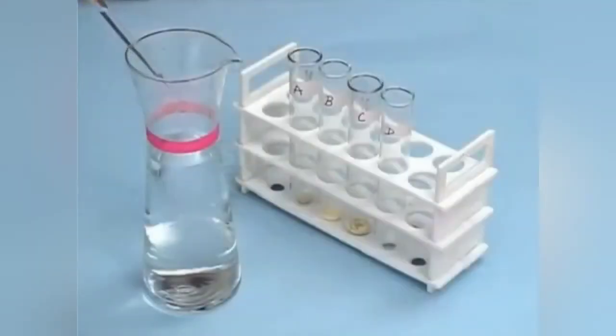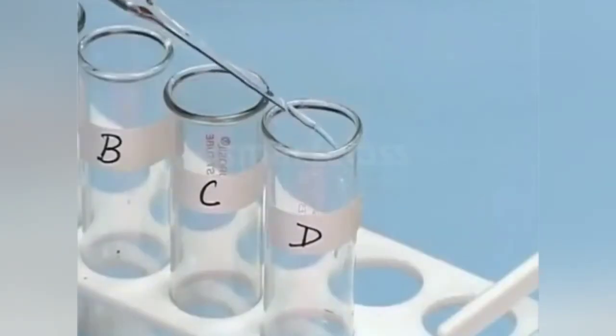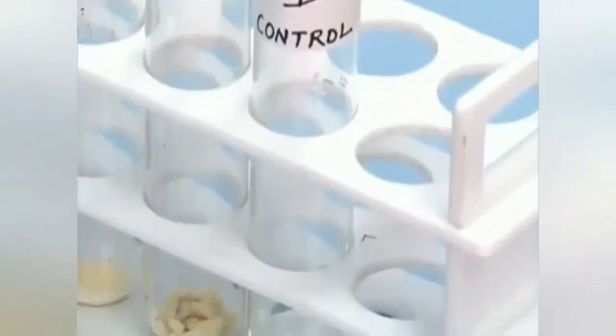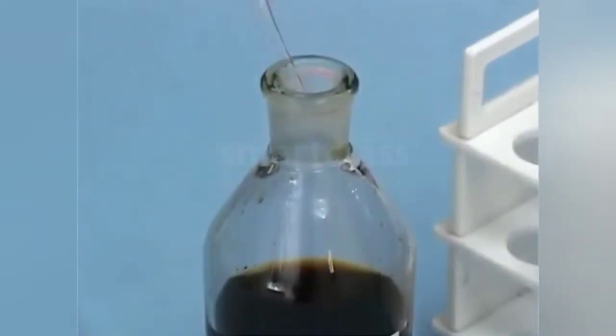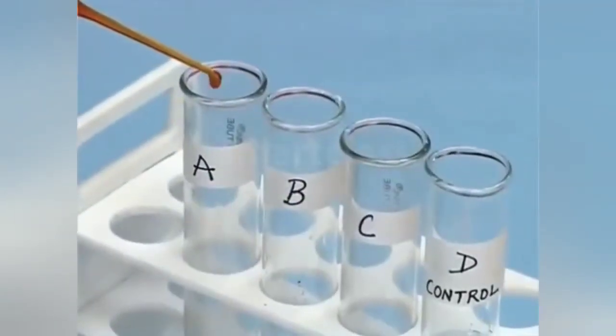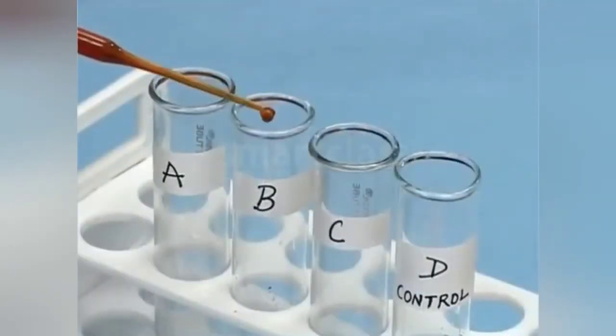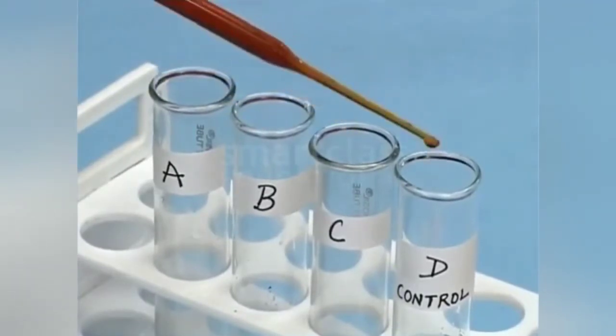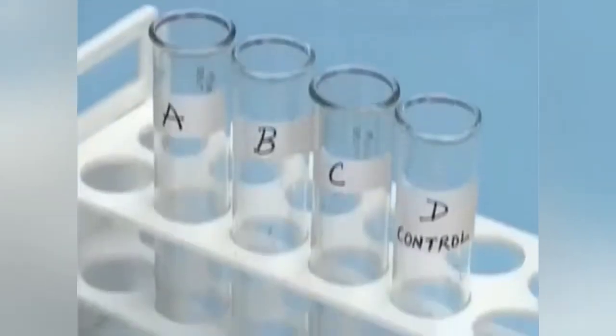In the test tube D, add a little amount of water and label this as control. With the help of a dropper, add few drops of iodine solution in each test tube. Now wait for 1 to 2 minutes and observe.